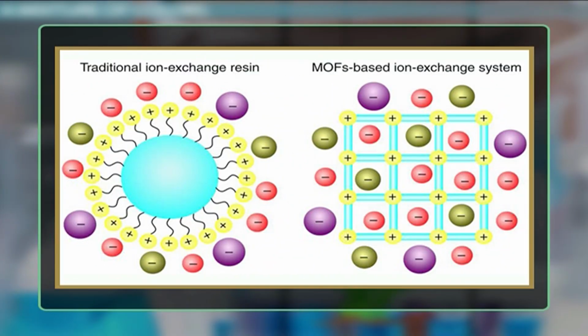Additionally, the buffering component should not act as an eluting ion by binding to the ion exchanger. Anionic buffer components such as phosphate or MOPS in cation exchange chromatography, and cationic buffers such as ethanolamine, Tris and Tricine in anion exchange chromatography, are recommended.